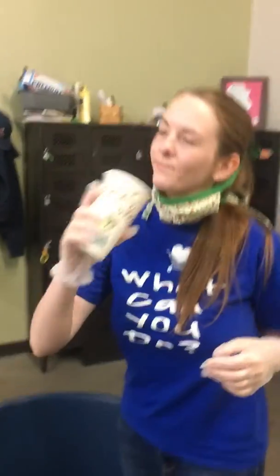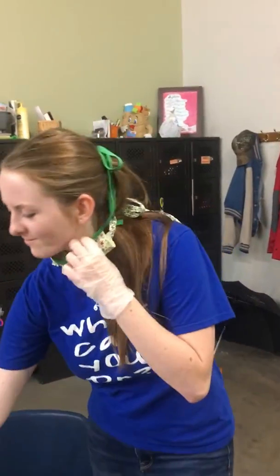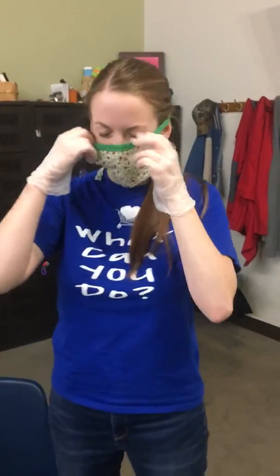So you have your mask on. And you've been working diligently for a couple hours and your hands are considered contaminated and gosh darn, that mask is uncomfortable, so you're going to reposition it. The outside of the mask is considered quite contaminated, so you do not want to touch the outside of your mask or reposition it. Another thing you don't want to do is, you want that cup of coffee, so you just pull that mask down, drink your coffee with your dirty gloves, and then put that mask back on, because you have just contaminated your face. So those are some quick do's and don'ts for wearing a mask and gloves.